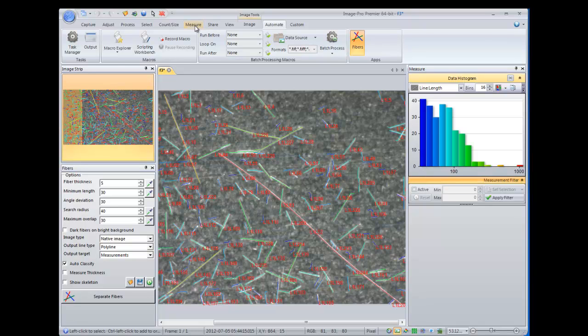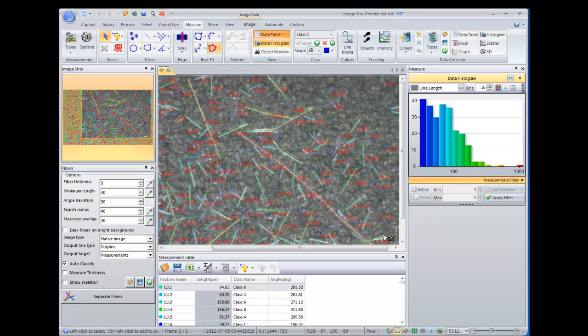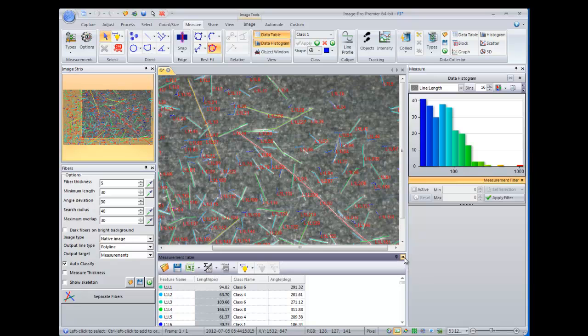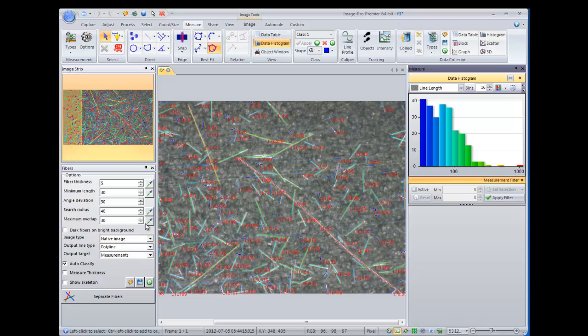You can also go into the Measure tab of ImagePro Premier and open up the data table if you want to look at measurements. And all of those measurements can also be exported out into Excel.